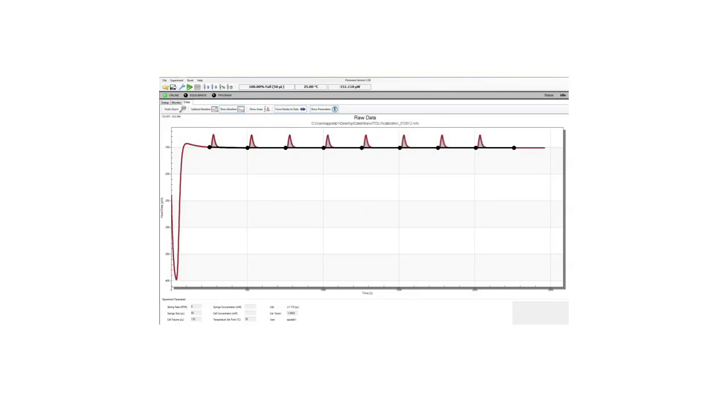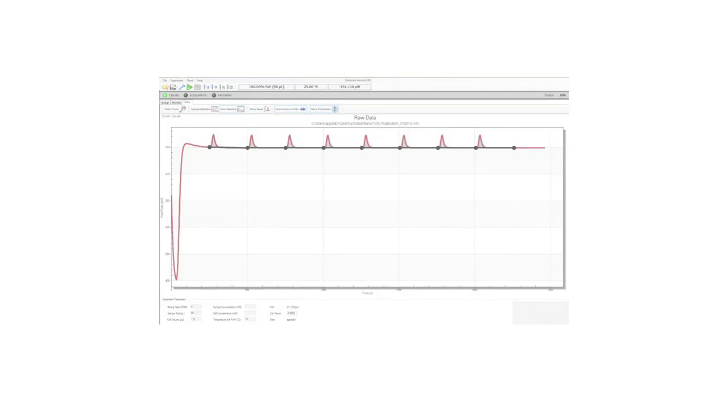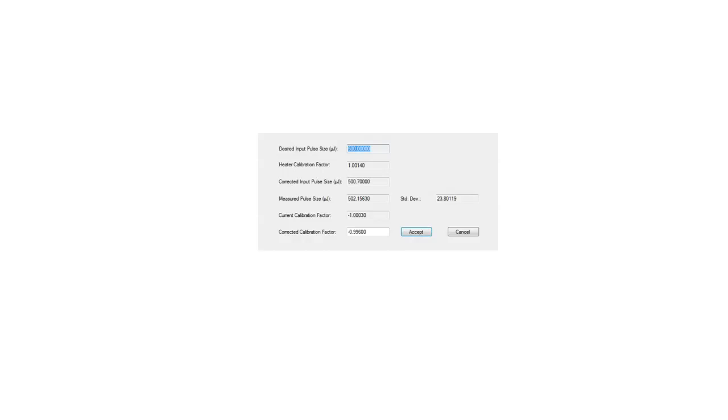A window will then pop up that looks like this and you will see your new calibration factor here. This is your old, this is your new calibration factor. They should be fairly similar as long as your instrument is clean and there are no problems with your instrument.